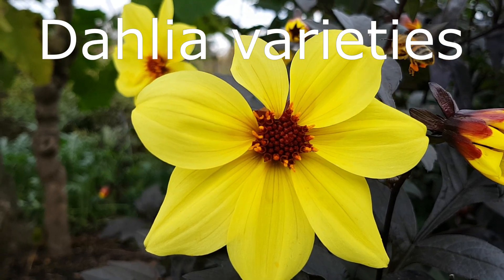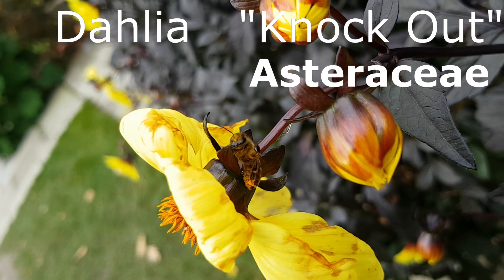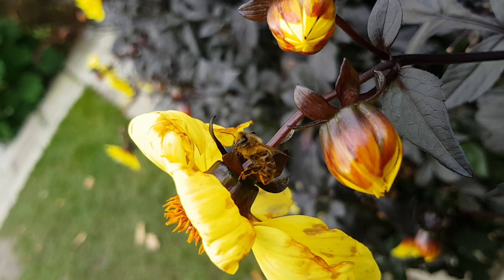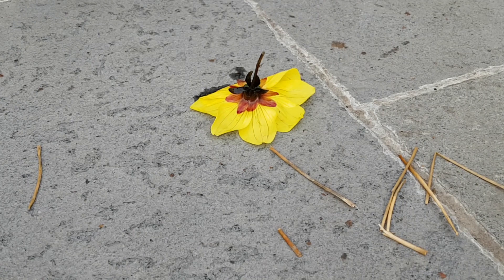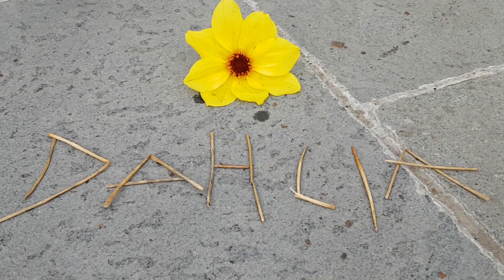I've included dahlia because it's spilling over into the end of October. This particular variety is called Knockout, and the bees certainly thought so. Let's look at the pollen.